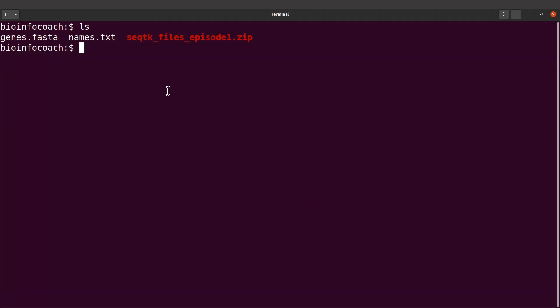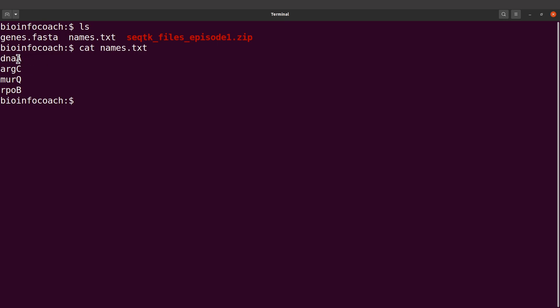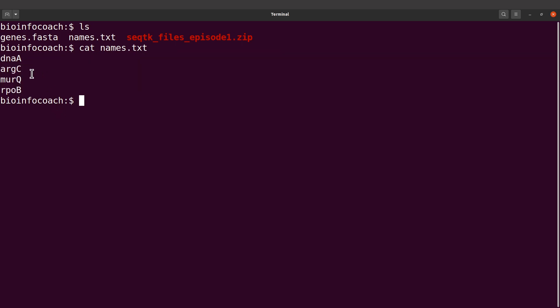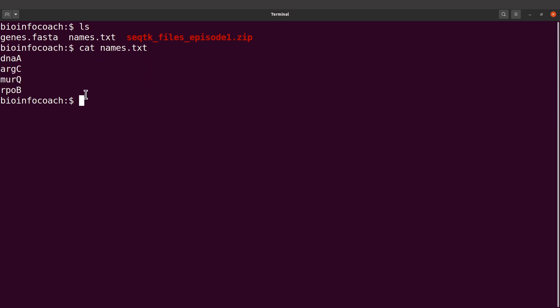For this tutorial, we are going to extract sequences from this FASTA file. The sequences of interest can be found here — I will show you where to download the example data. So here's what we are going to do: let's first display the names for the sequences. We are going to extract the corresponding sequence for each of these names, then save them to different output files. In the previous tutorial, we extracted the same sequences but saved all four to a single output file. In this tutorial, we will save each of them to a separate output file.